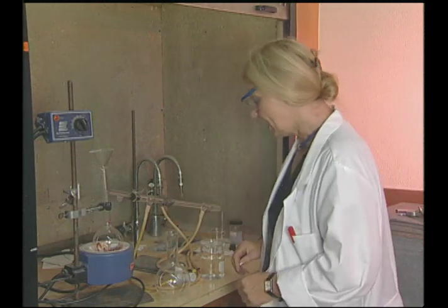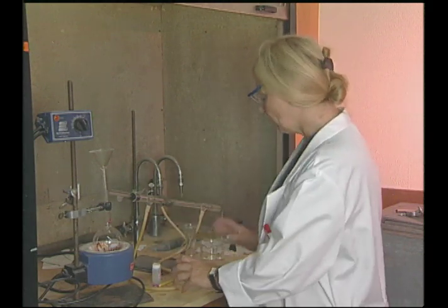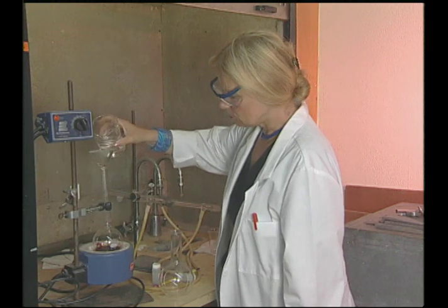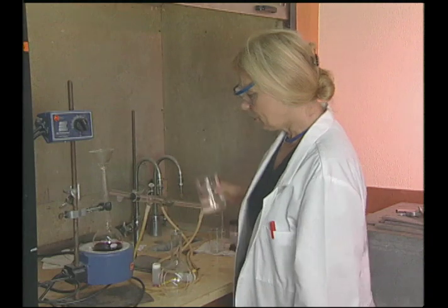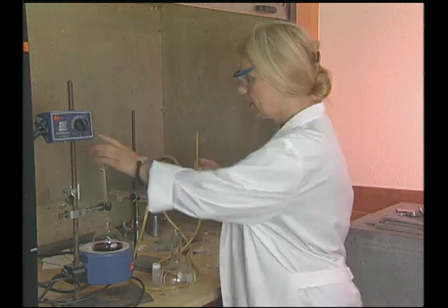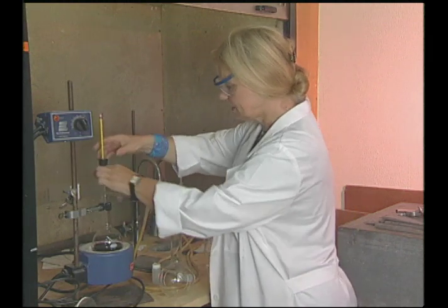So in our case, we have potassium permanganate, some purple crystals that make wonderful magenta colored solutions. So I'm going to add a little bit more water. It's very concentrated, but we did that so we can see the color. And when we do the separation procedure, we have to put a thermometer in here and seal off the system.